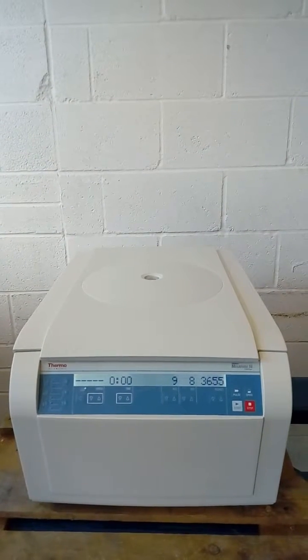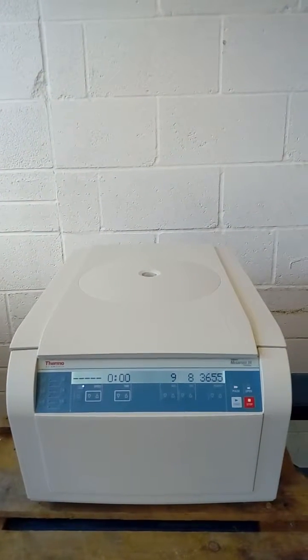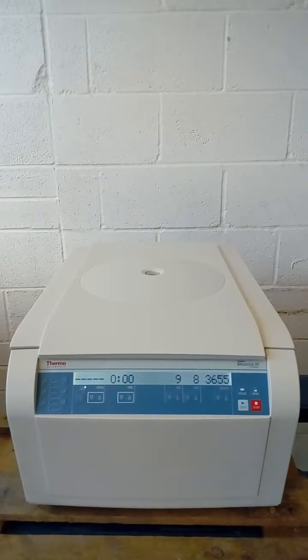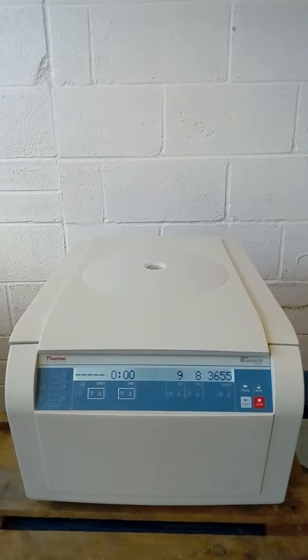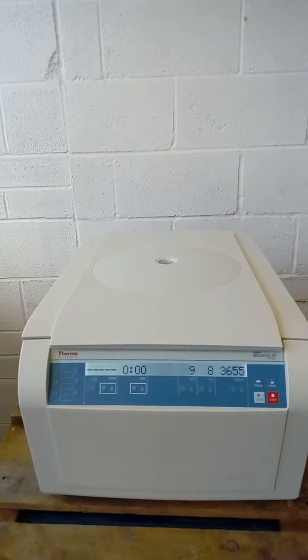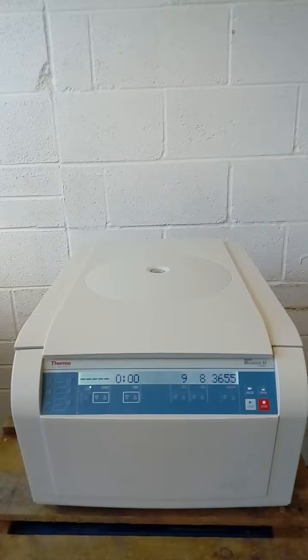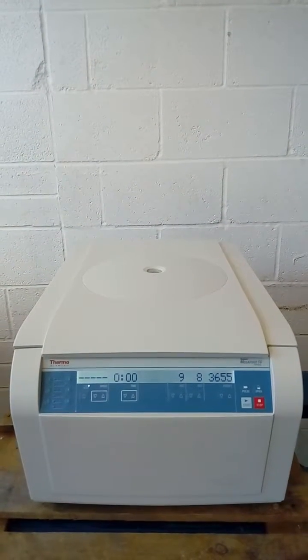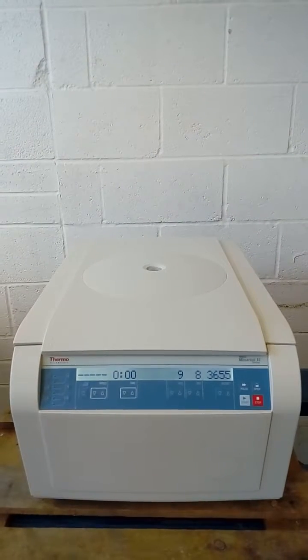This is Lisa Gregory from Richmond Scientific. I'm conducting a small video on the Hiraeus Megafuge 16 centrifuge by Thermo Scientific. The centrifuge is currently switched on and ready to be tested.